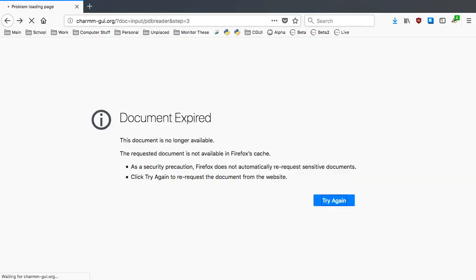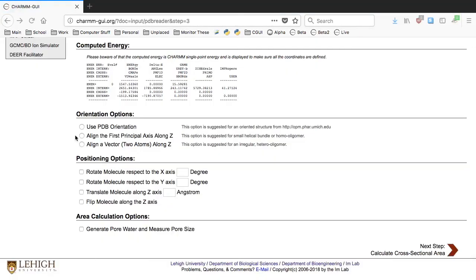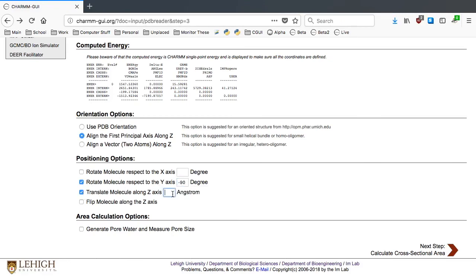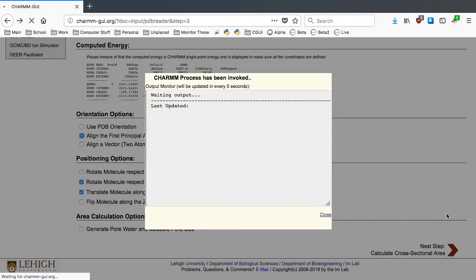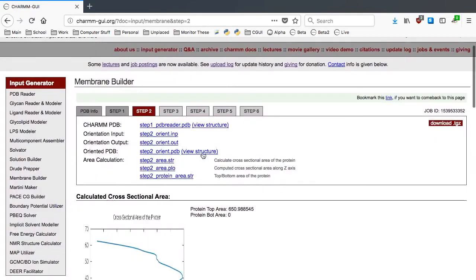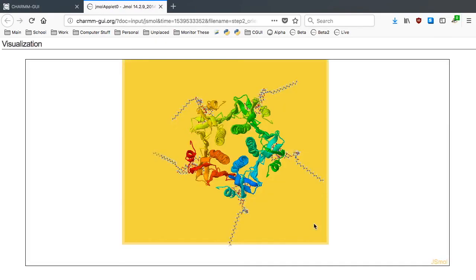So we should go back to the previous page again and add an option to translate the molecule along the Z-axis by 40 angstroms. This is an approximate guess obtained by trial and error.